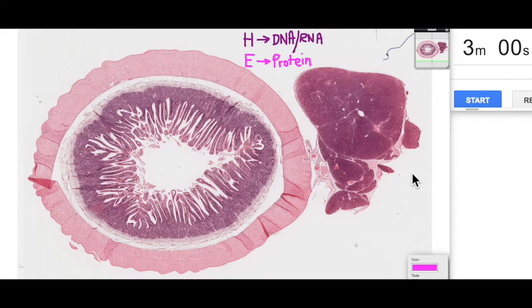In this episode we're going to continue our look at staining. In the last three videos we've looked at the overall pattern of staining at low magnification, with our understanding that hematoxylin stains DNA and RNA, nuclei and rough endoplasmic reticulum, and eosin stains protein.